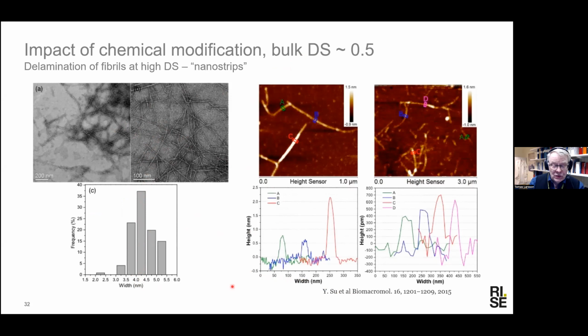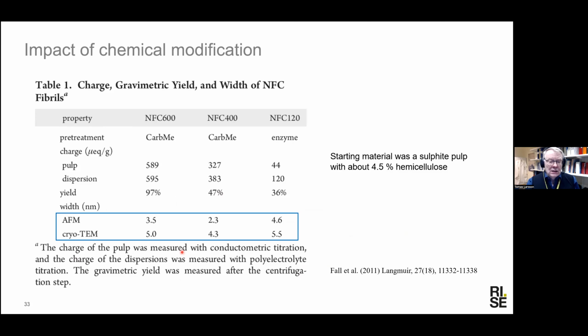There's a distribution, of course, but also they can determine the thickness of these strips with AFM. And you get essentially a single molecular layer. You get a sheet of polymers according to the measurement of AFM. So, and obviously that's not the same supramolecular structure that you had in the starting material, or even after isolation. And you have seen this also by other microscopy techniques.